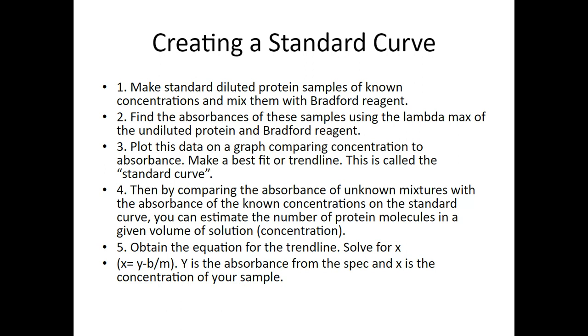And then the Bradford reagent. Once you get those absorbance values, plot them on a graph comparing concentration to absorbance. Make a best fit or trend line. That's called the standard curve. So that's always been a standard curve: the trend line, the R squared.